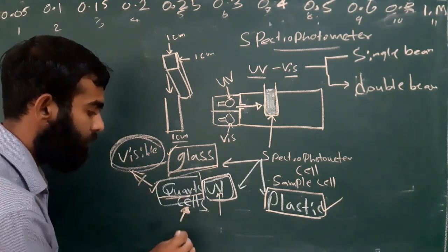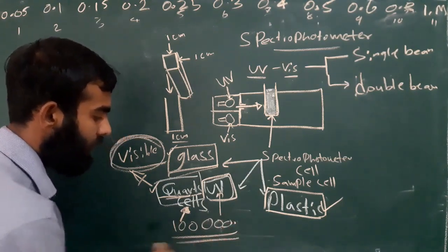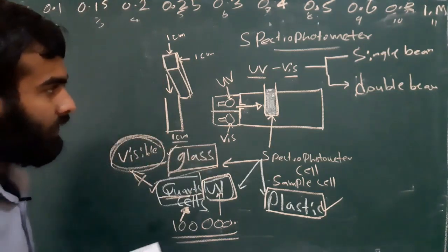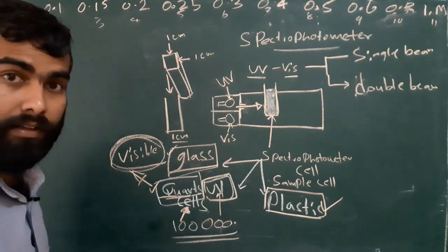Very expensive, around 1 lakh for one cell, so very expensive. We have to be careful about that when we are using it. Okay. That's the thing about these cells.